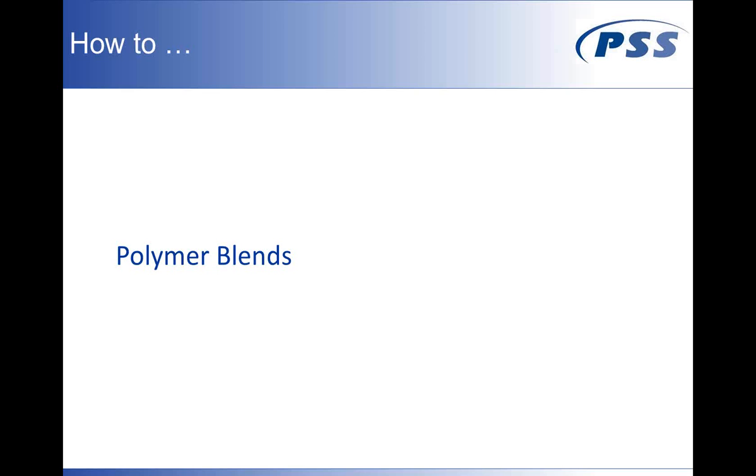Okay, thank you very much. Thanks, Derek. Yes, actually, most of you have been correct. The method of choice, to my understanding, to separate polymer blends is gradient chromatography. In a blend, you have two polymers which have different critical compositions. Critical composition is responsible for the elution time in a gradient, and therefore you should be able to separate a blend in a gradient. We will also discuss quickly later on the critical mode.